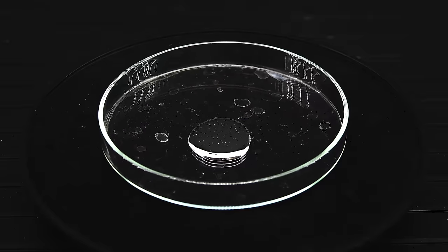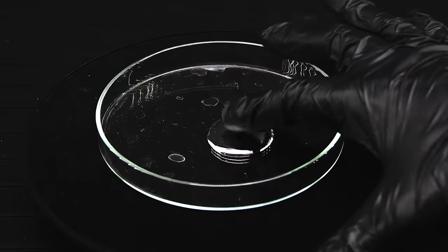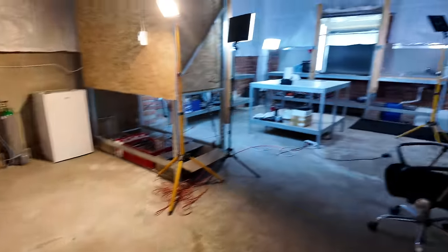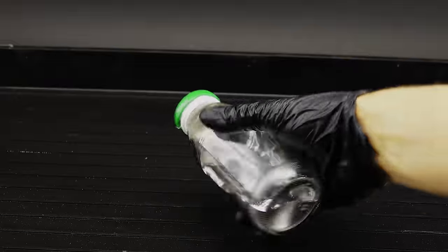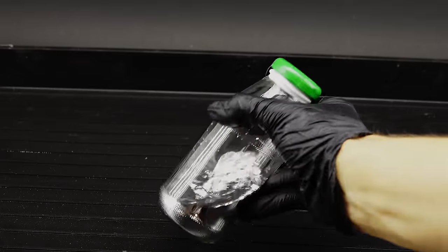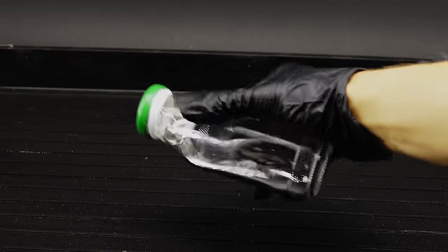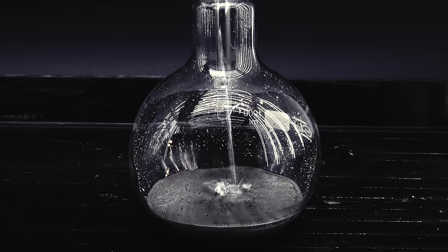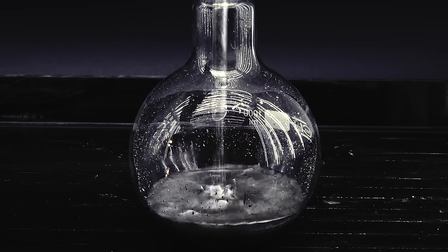However, now, almost a year later, my circumstances have changed a little, and apart from having an amazing new lab with tons of safety equipment, my total amount of mercury has increased exponentially. I won't get into much detail about it here, because I don't know if the YouTube overlords would like it, but in short, I now have a ton of dirty mercury, which opens up some interesting possibilities.